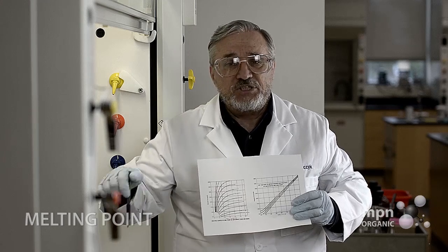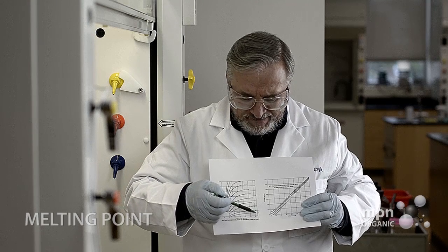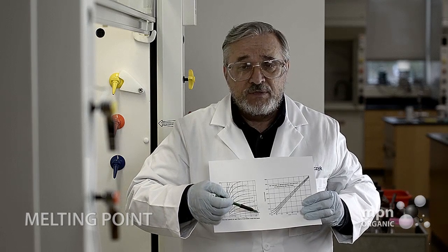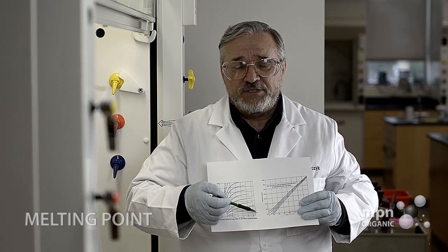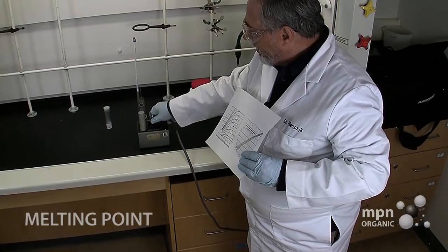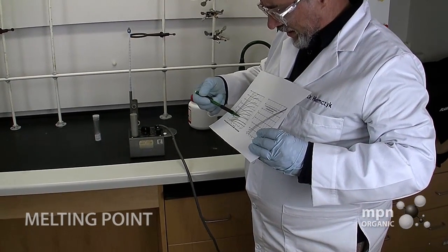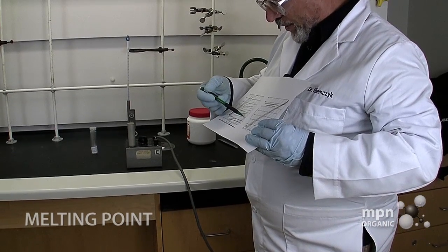Now if I were to set this to 20 volts, what I can expect then after about 30 minutes is the temperature leveling off at about 78 degrees centigrade. Obviously, if I put a higher voltage, let's say 40 here, I follow this line, I can get up to 141.